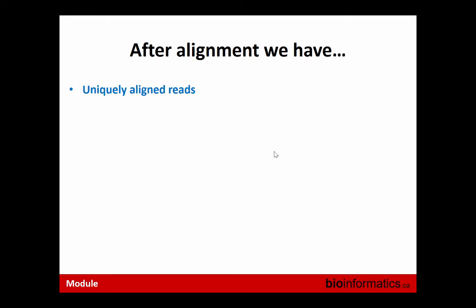For sure you're wasting some reads, but that's basically your QC, right? You run your alignment, and if you see that 92% of your reads are uniquely aligned, then you're happy. You probably sacrifice this 8% of your reads. Some of them legitimately don't belong to your experiment, but some may be aligner errors. It's just a trade-off of speed, but it's a very good strategy. I don't think we use this routinely in a pipeline, but if your data is very valuable, you can take unaligned reads and try some other aligner. From my experience, you don't rescue too much, but one can try it.